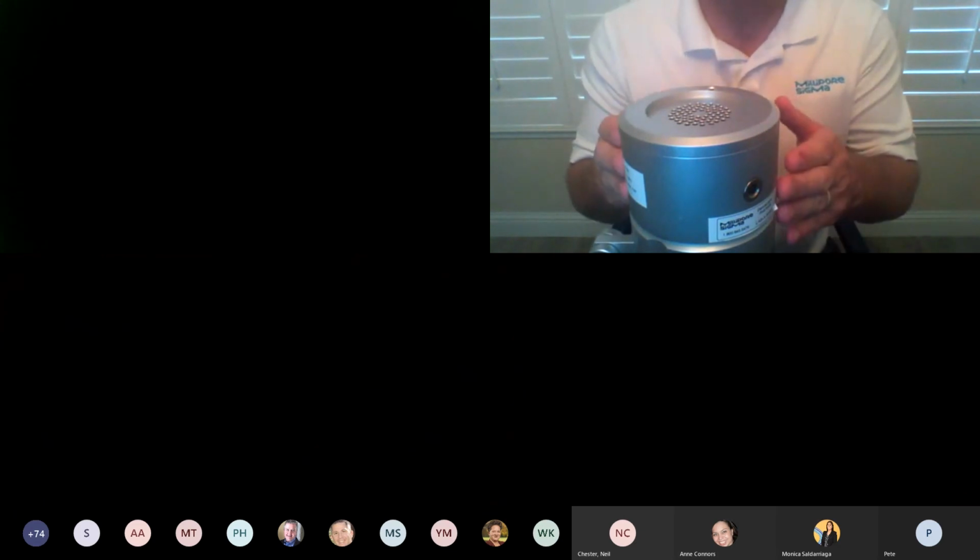But if it's not, if it just can't hold that value, that means that you might have a mass flow sensor that's starting to fail. And that's a key, because if you've had this instrument for, let's say, 5 years, and you use it a lot and you've calibrated it in-house, but you've never sent it out for service, you might end up seeing that you can't hold that calibration, and that just means the mass sensor is starting to go.